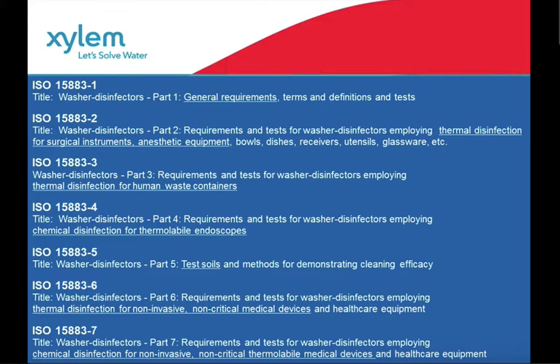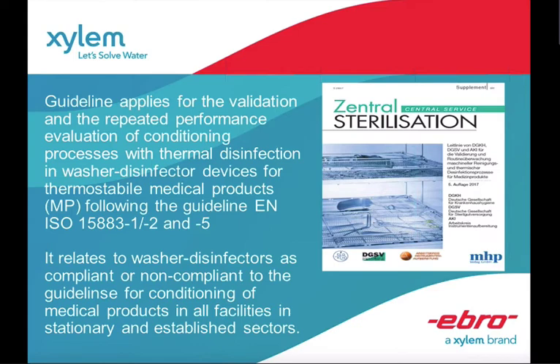And there are parts 5, 6, and 7. Anyway, you will have a copy of this. But this is a very good guideline or standard that you can refer to when you talk to your customers. This guideline applies for the validation and the repeated performance evaluation or routine monitoring of conditioning processes with thermal disinfection in washer disinfectors.